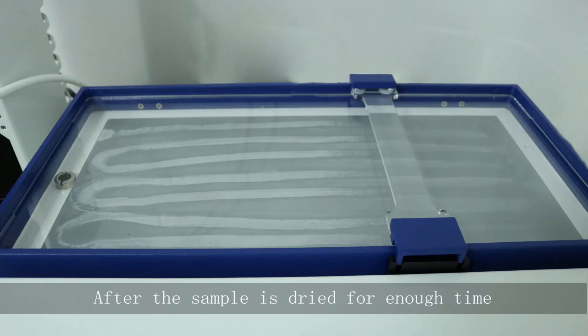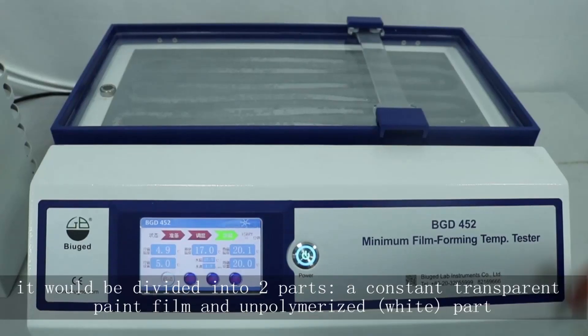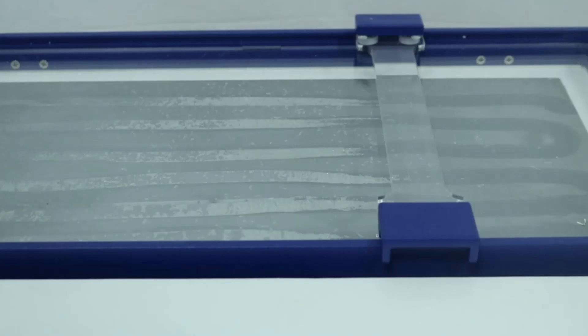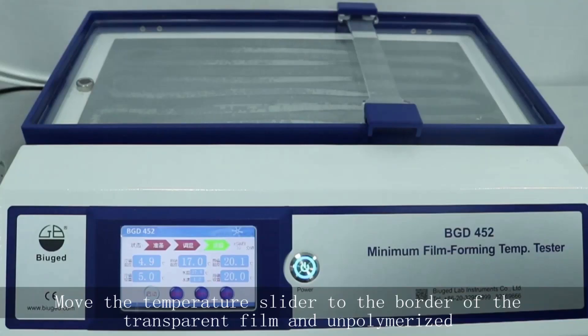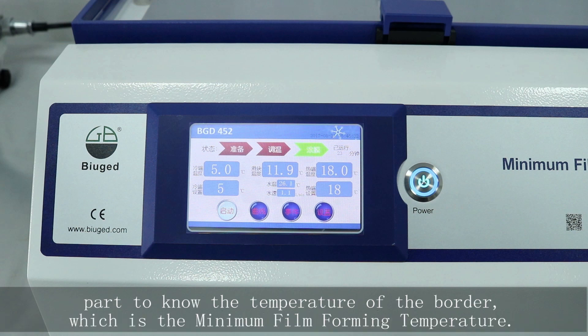After the sample is dried for enough time, it will be divided into two parts: a constant transparent paint film and an unpolymerized white part. Move the temperature slider to the border of the transparent film and the unpolymerized part to find the minimum film forming temperature.